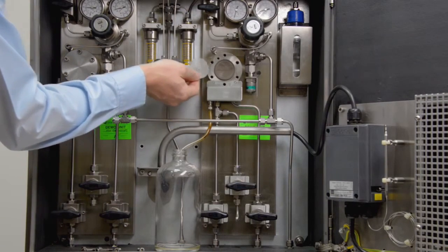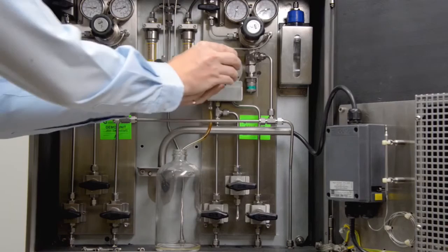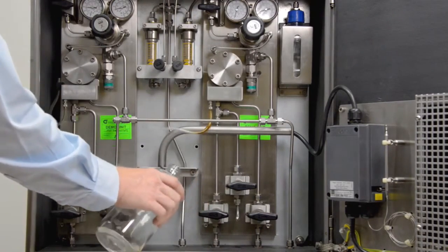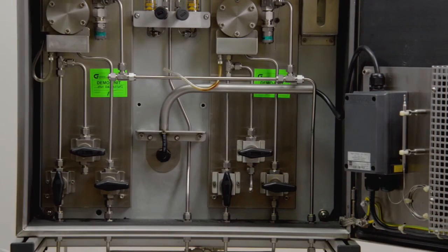Change filters and O-ring if required. Put back the cover and fix it. Remove the pouring sample via the tube. Open the valve again.